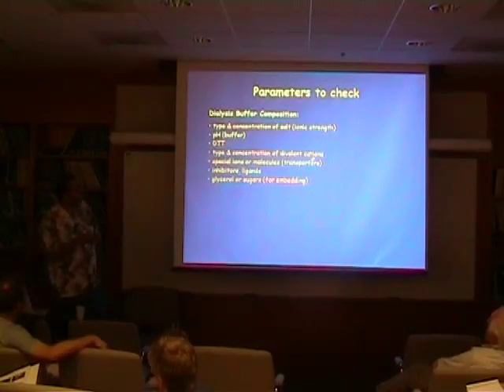And very often magnesium has the milder effect than calcium. So if you get an effect at 10 or 100 millimolar magnesium, you can very often get the same effect with 10 millimolar calcium. Calcium seems to be a much stronger agent.